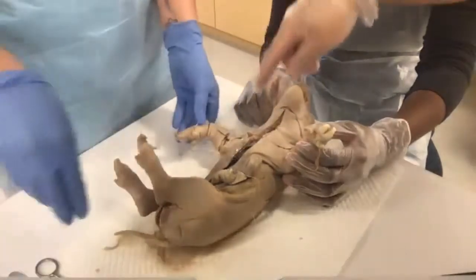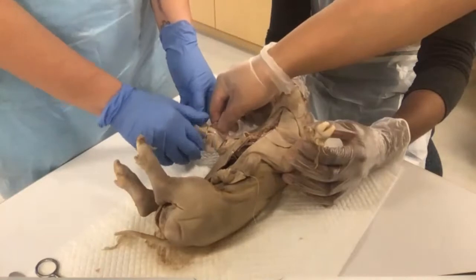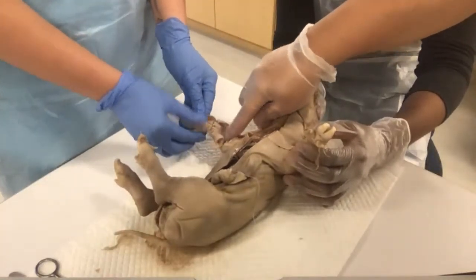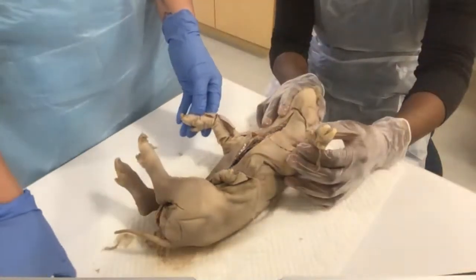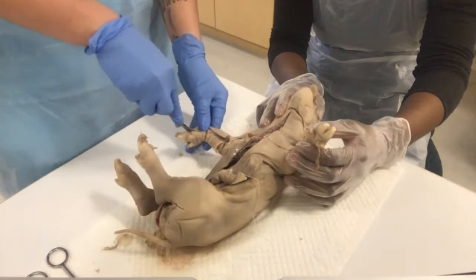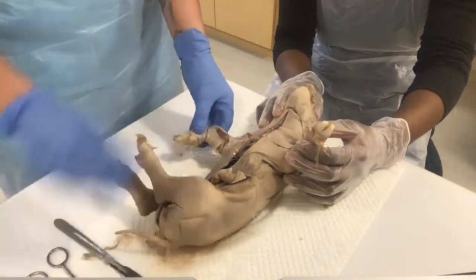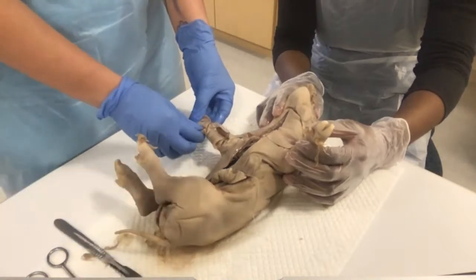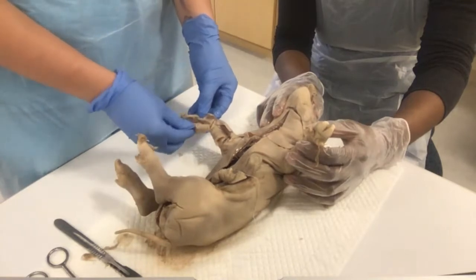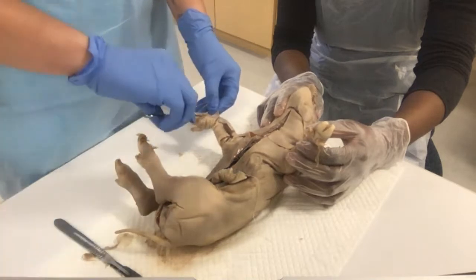So what our surgeon here is trying to do today is open it up, and we're going to try to trace that shiny covering to a bone and to a muscle to see if we can identify a tendon. And remember, a tendon is that fascia that's covering the muscle that all bands together and then connects the muscle to the bone, hence the term skeletal muscle. So that's any muscle that's going to move my skeleton.